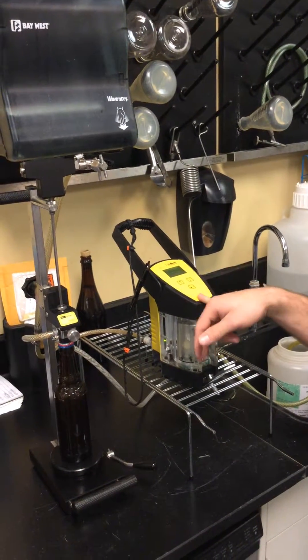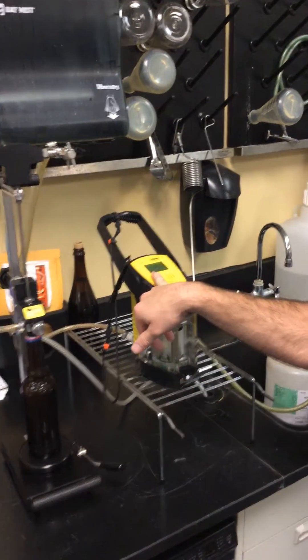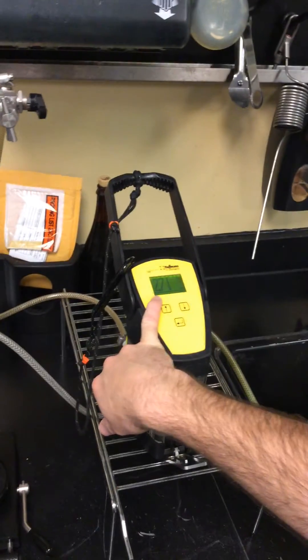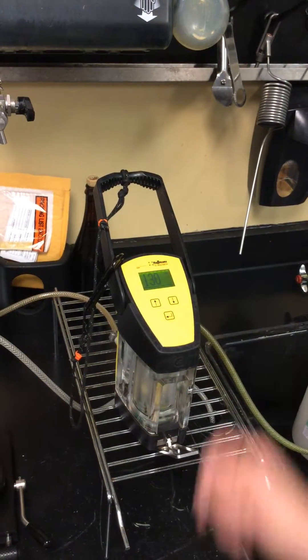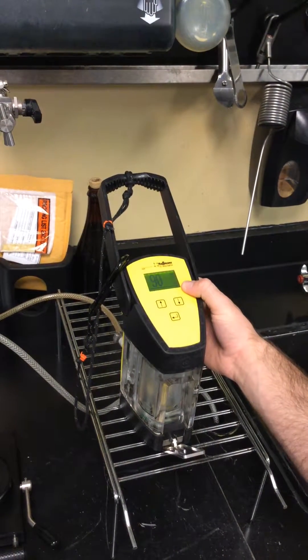Actually test it to make sure that the gas is going through correctly. It should read zero parts per billion with pure CO2 at 2.1 bars, and as we can see it is decreasing rapidly.